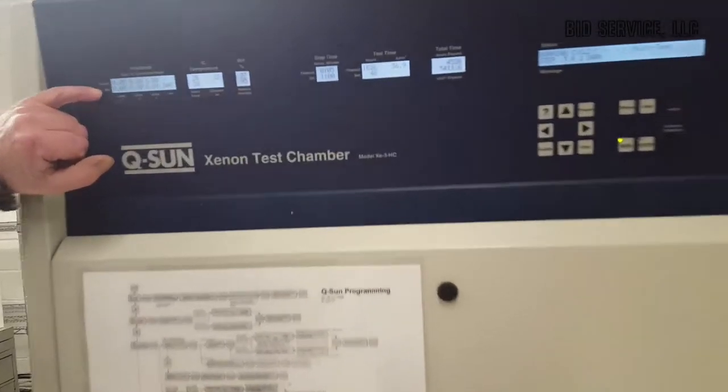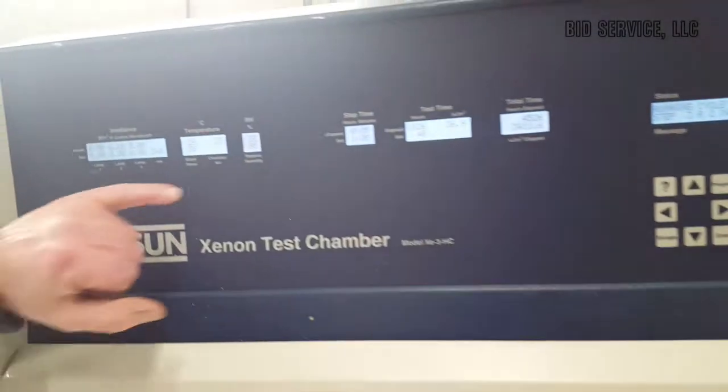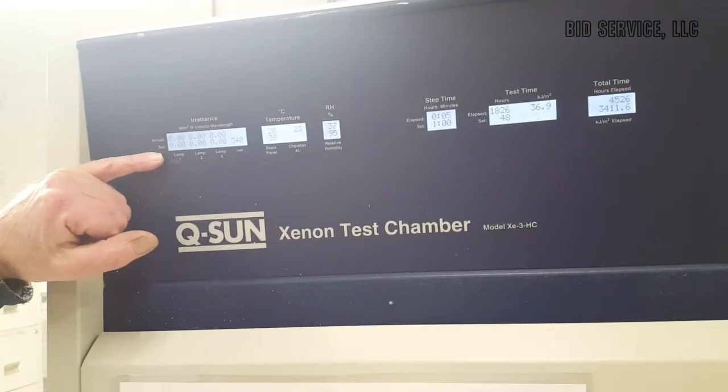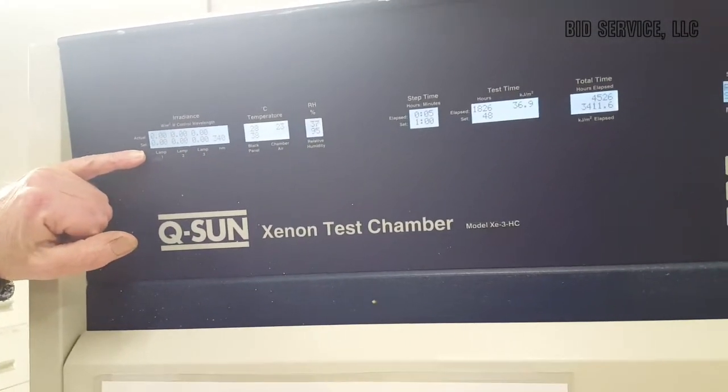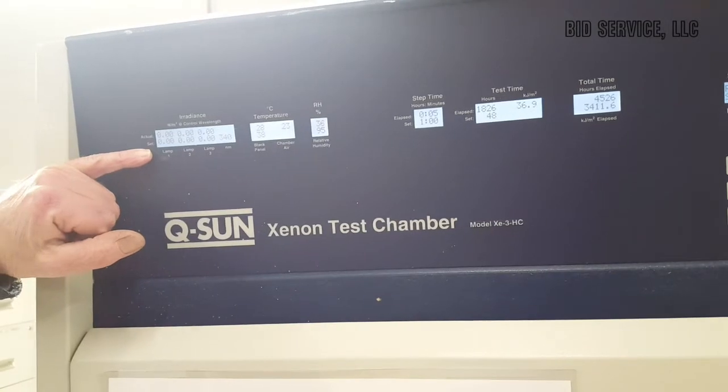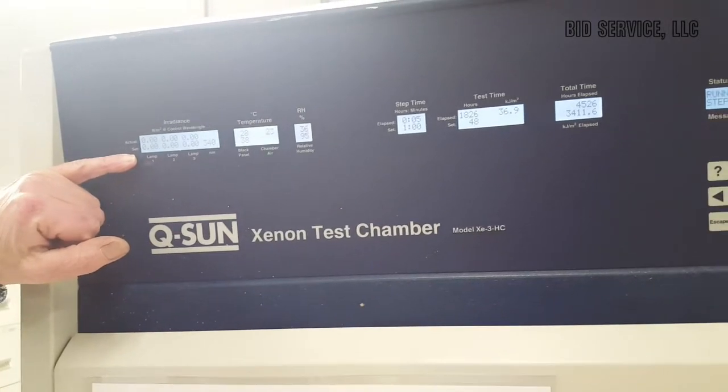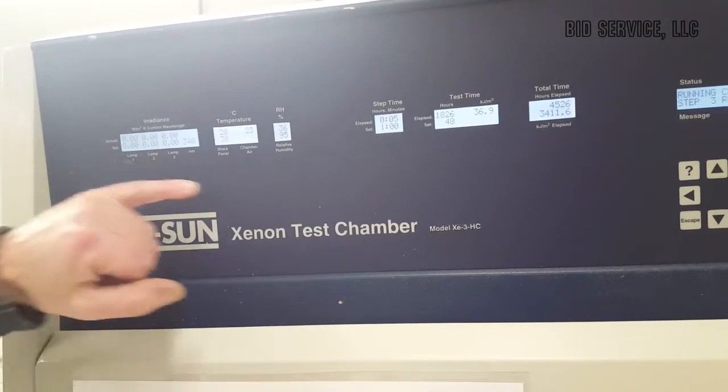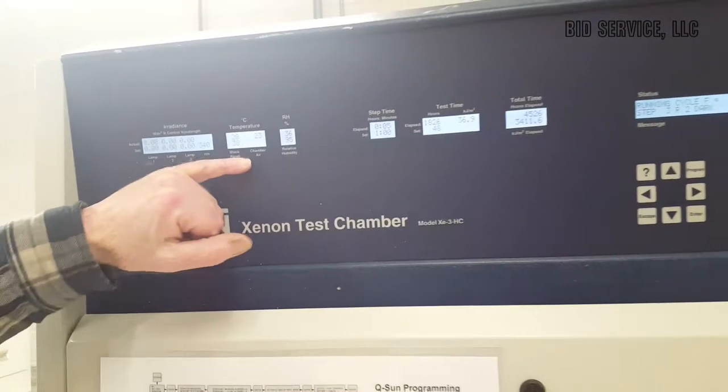If we look at up our panel here, it's now zero since we don't have the lamps on anymore. And we will come back in a little bit and see how we do.